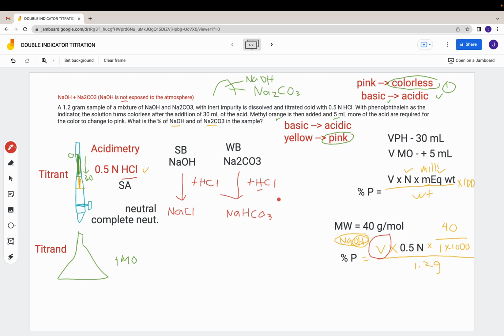Your H is acidic. It indicates that your HCl is acidic. And this H is being taken up by your sodium carbonate so that it can form your bicarb, meaning to say, it gains this hydrogen, indicating that from weak base, it becomes weaker. So that's just for the sake of magnitude. This is double weak compared to this one and to this one, right? But it's still basic. At this point, you call this your half neutralization. So let's put the fraction here, 1/2.